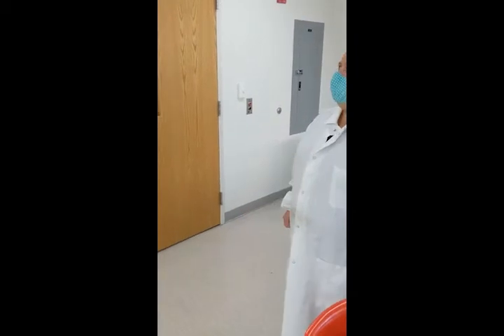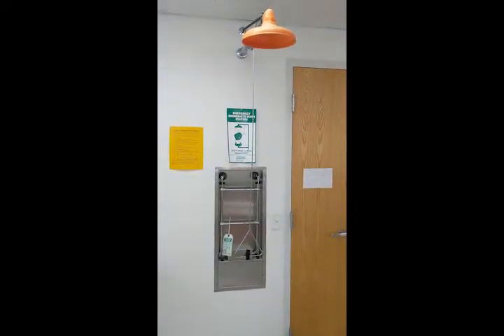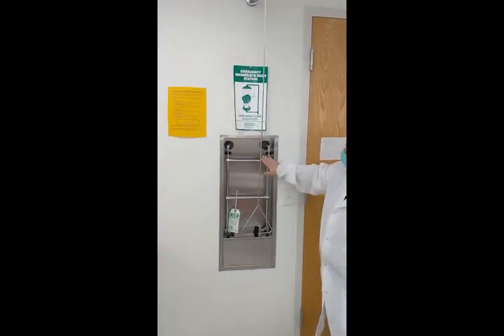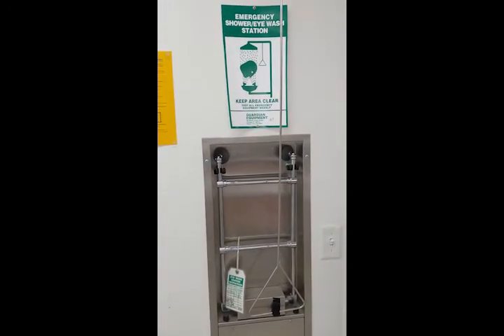In the event that you spill some kind of chemical on yourself or get chemicals in your eye, we have a safety shower in our lab. The safety shower is right here — here's the handle, and this is the eye wash. You need to flush for 15 minutes if you do get something in your eye.